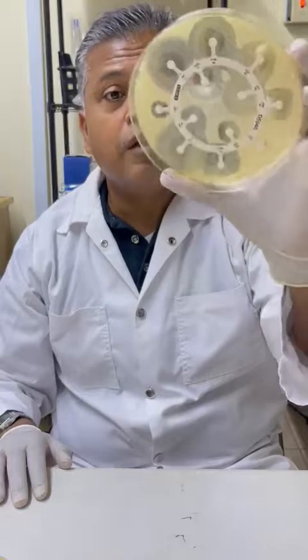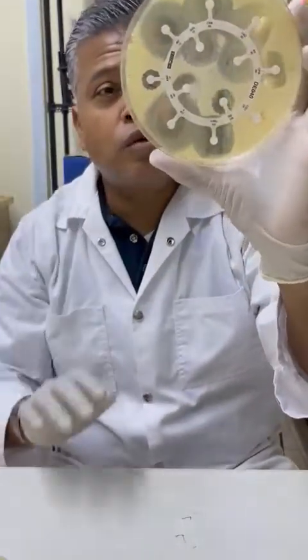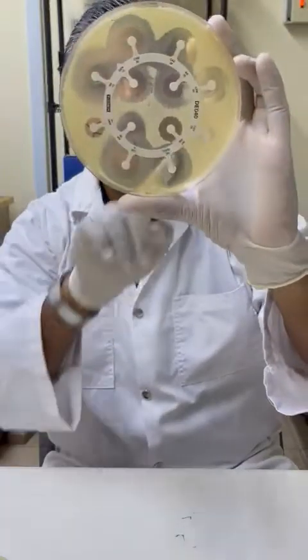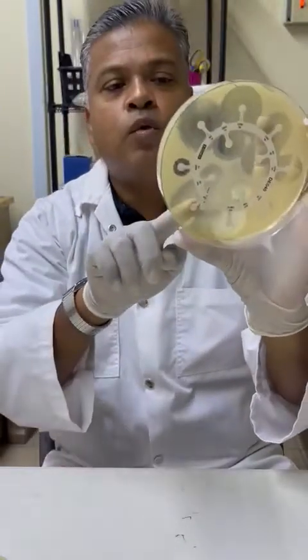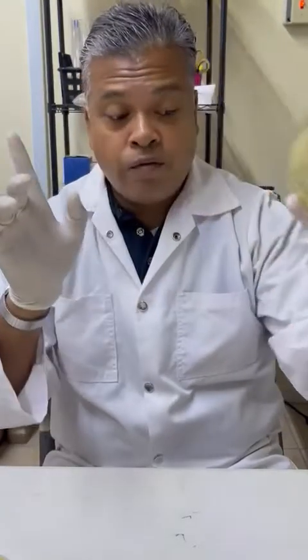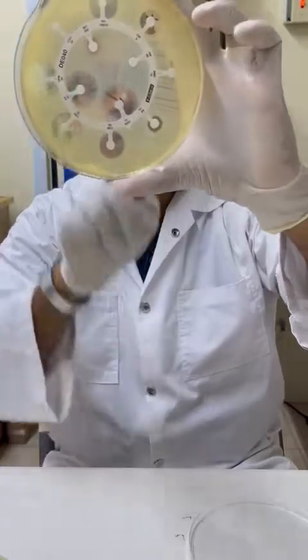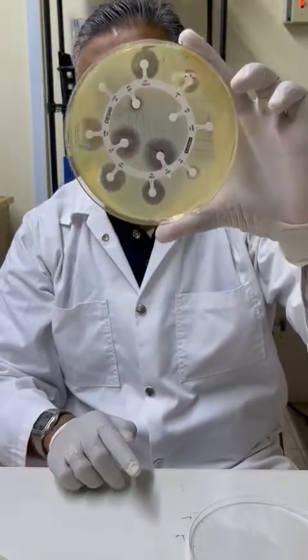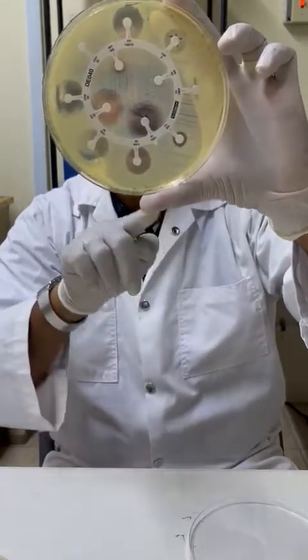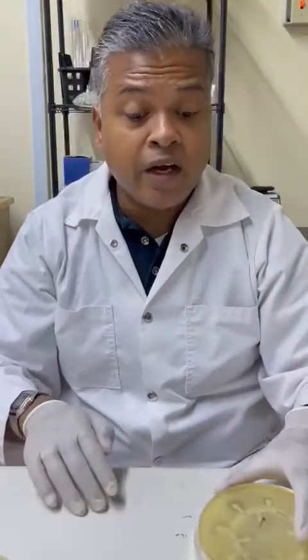In this patient, we've got resistant to Augmentin because it's a very small zone. We've got also resistant to Septra, but this one is sensitive to ciprofloxacin. So you have 2 out of the 3 commonly used antibiotics here resistant. Then also for this patient, we've got ciprofloxacin with a very small zone, we've got Augmentin, and we've got sensitive to gentamicin. All right, 2 out of 3 again.